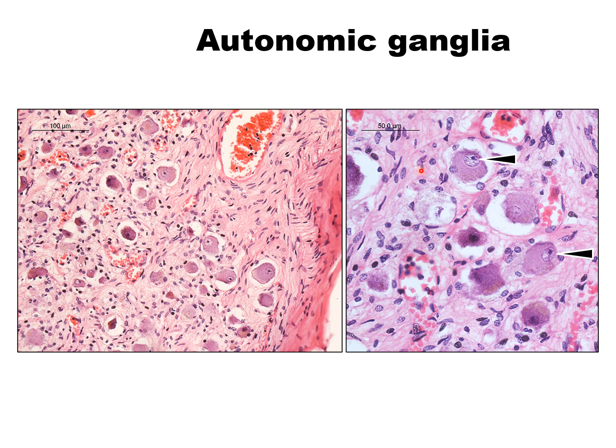The nerve fibers separate individual cells, but in the sensory ganglia, we have seen groups of cells separated, because here the cells are multipolar. So the nerve fibers have to pass from the soma, and individual neurons are separated by nerve fibers. These are the blood vessels.